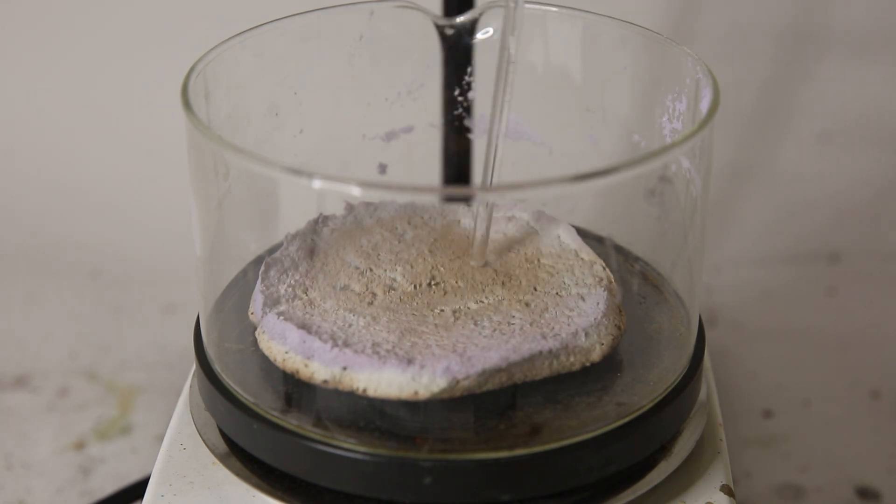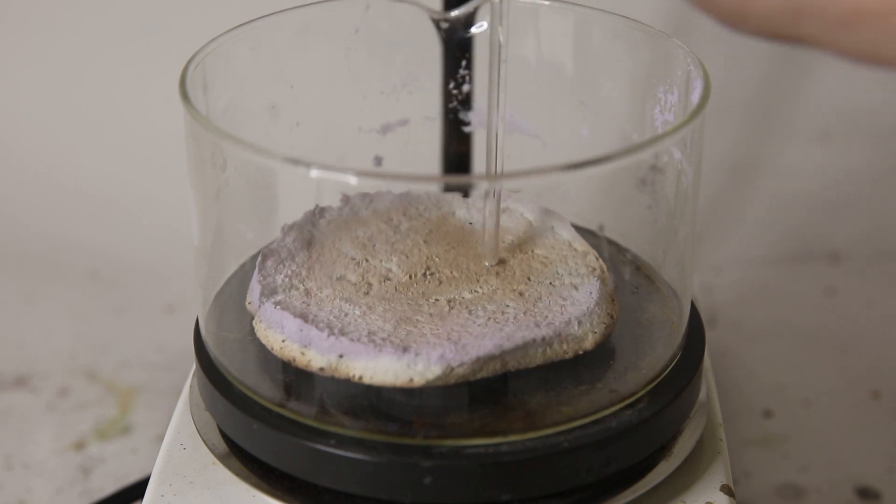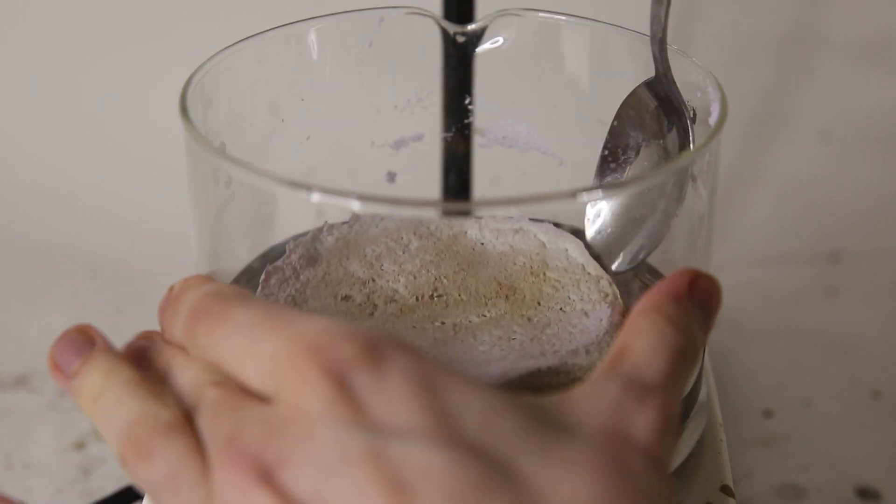It is also discolored, because silver chloride degrades under the influence of light to silver and chlorine gas. The discoloration is therefore not a problem, and it will actually help us later.